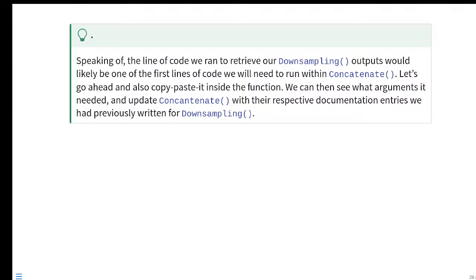In a similar situation, if I have data from a Sony instrument and I have data from an Aurora, I would not be able to combine them just because the internal slots are going to be so dramatically different. If you're trying to do that kind of a combination, you could try extracting out the exprs matrix and then combining them together in that manner. You would want to minimize all the additional metadata, parameters, and descriptions that would be mismatched between those instruments and just try to combine equivalent data.